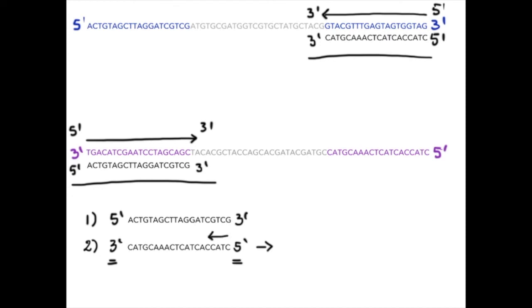Note that we're not reverse complementing the sequence, we're just reading from right to left because this is already the sequence that we need. So that gives us 5', and then C, T, A, C, C, etc. and so on until the very end, which is T, A, C, and 3'. And that's it. This is the final sequence. This one we don't need because it's indicated in the wrong direction. So our final answer is that it's this sequence here that will be the primer for the top strand.